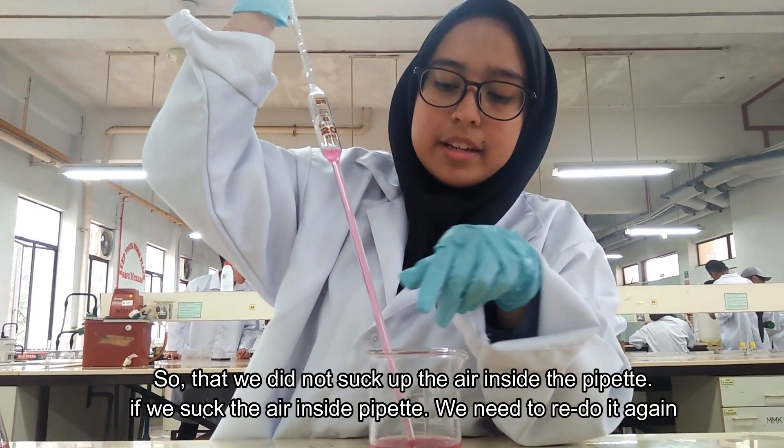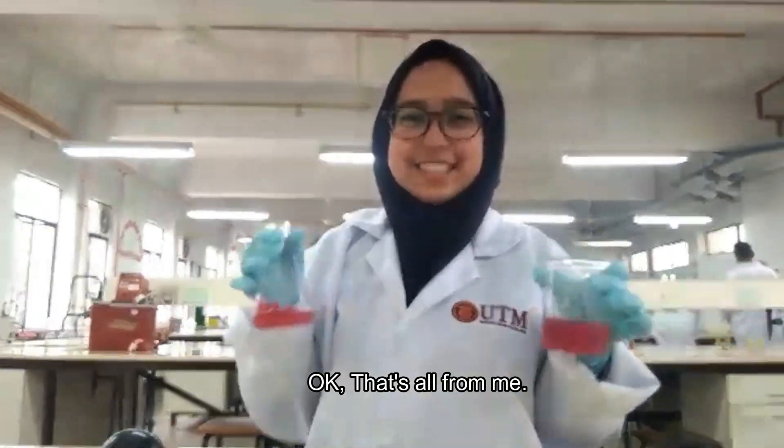If we suck air inside the pipette, we need to redo it again.